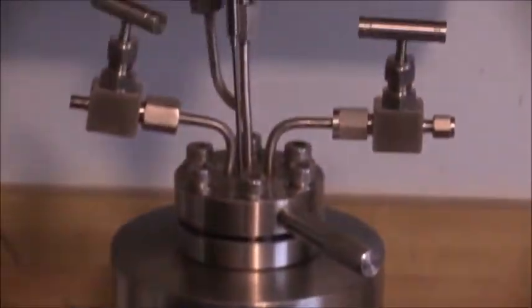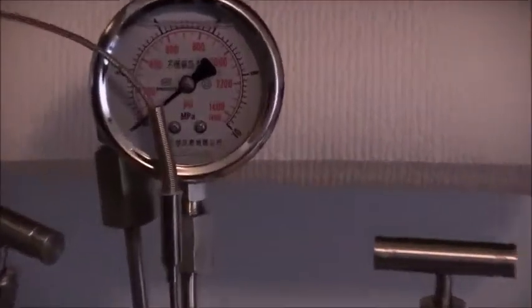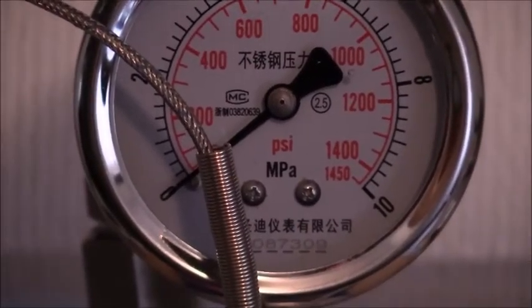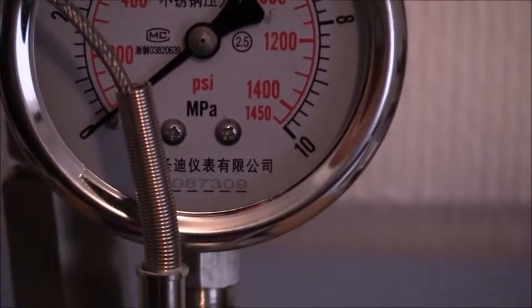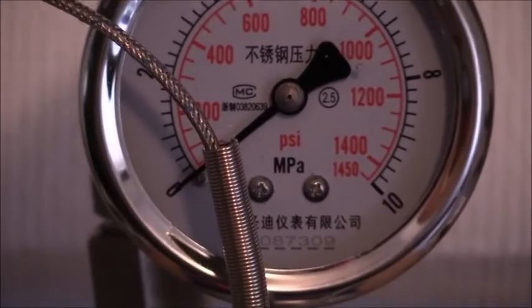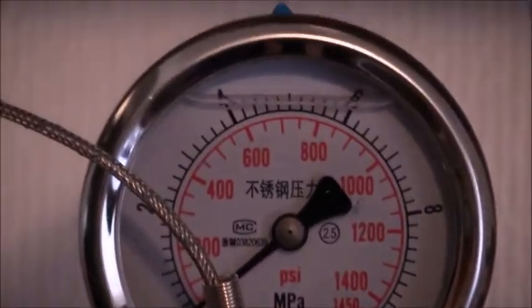At the very top here is the pressure gauge, which displays the internal pressure during an experiment. The pressure gauge has a scale in pounds per square inch in red and also in megapascals in black. The maximum pressure that this device can reach is 1,450 pounds per square inch, or 10 megapascals, although the manufacturer suggests that exceeding 8 megapascals for any length of time may create unsafe conditions.